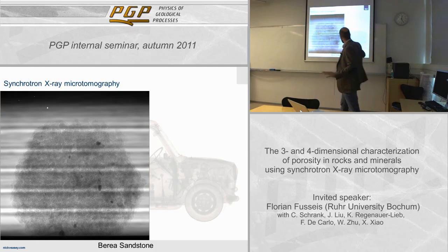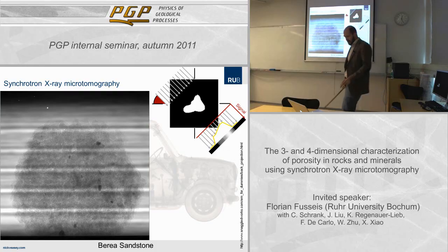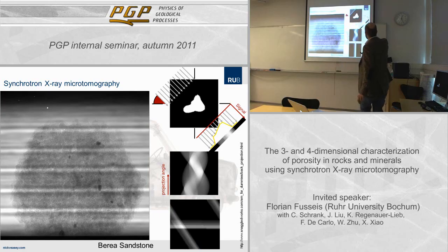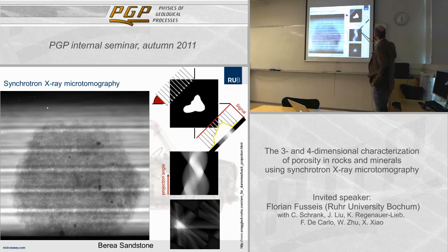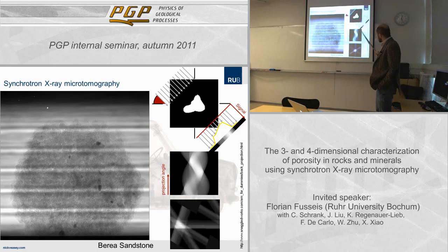Think of this as our detector here, which has a resolution of 2048 by 2048 pixels. Think of the signal that is detected along one line of these pixels, schematically shown here. So now we just show essentially the top of this plane. We see the X-rays, the photons coming in here, we see our object, and we record a signal which correlates to the amount of photons that have been absorbed on their way through that object. This is the signal that is being detected at any particular orientation. If we rotate the object, and the rotation angle is actually shown here now, and stack all of these signals on top of each other, and now this is only for one plane, then we get what is called a sinogram. And from these sinograms, through a process called filtered back projection, we can reconstruct what the object looked like, or looks like. It's a non-destructive way.